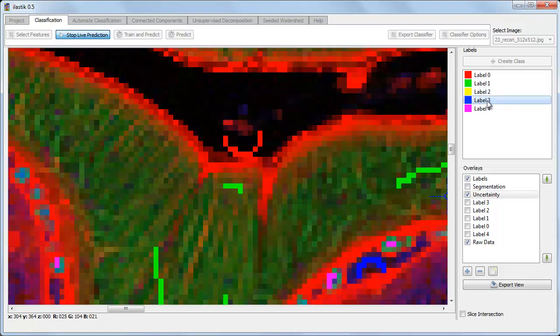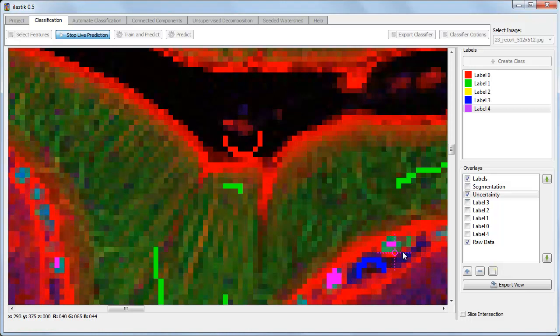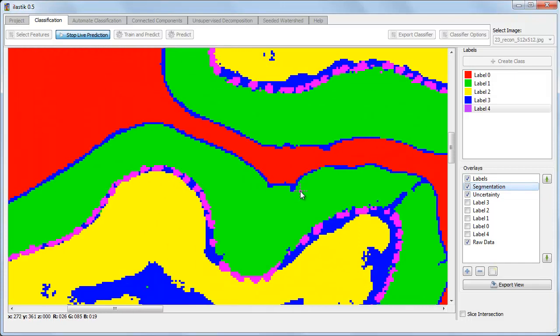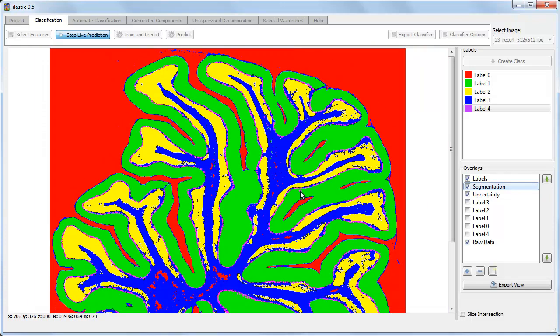And now let's try to fix the boundary between the green and the blue membranes. That didn't help as much. But since we're only doing this for demonstration purposes, I won't waste too much time trying to get everything perfect. Let's see how that looks. Still some confusion along the boundaries. But let's assume that we're happy with these results for now.